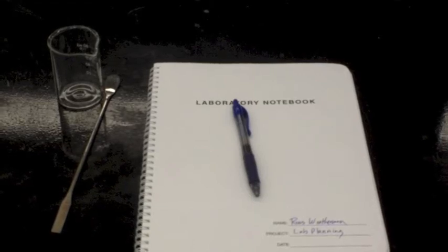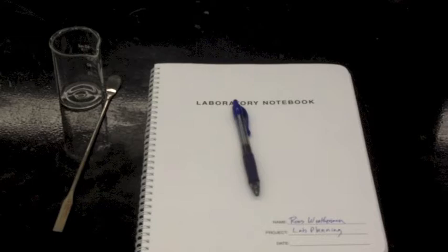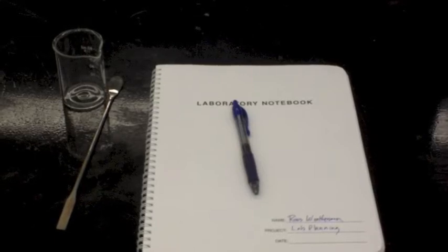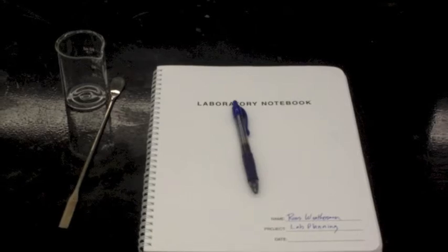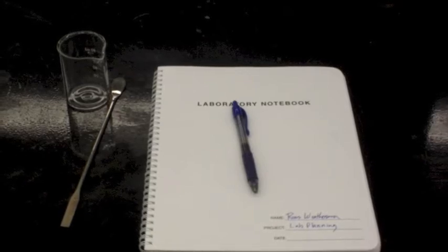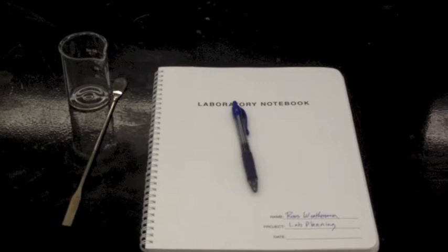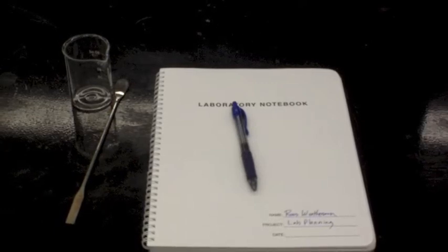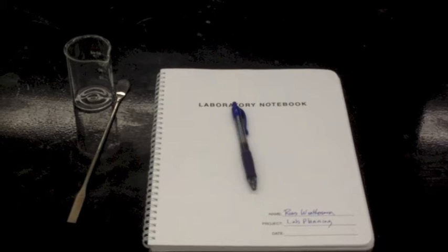You need to have something to write on—this idea that you'll always remember the number is a little bit flawed. Most people, especially when you start adding all those digits together, start to get confused, and that's pretty common. So have your thing you're going to weigh out with, the thing you're going to weigh into, your lab manual and a pen, and then you can walk up and be efficient in your balance operation.